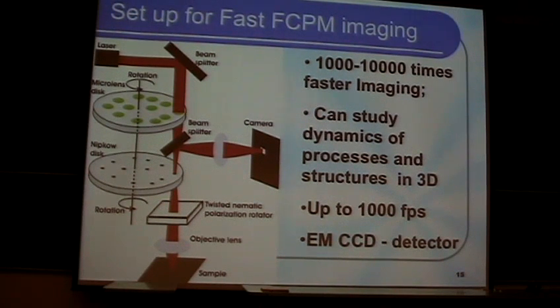Just like in the case of the regular confocal microscopy approach, the fluorescent light is propagated in the backward geometry through the same system of pinholes in the spinning Nipkow disc, and then because of this beam splitter in here, the fluorescence light at a longer wavelength is not able to go through it, but is reflected in this direction, and then reaches the photodetector such as a camera.